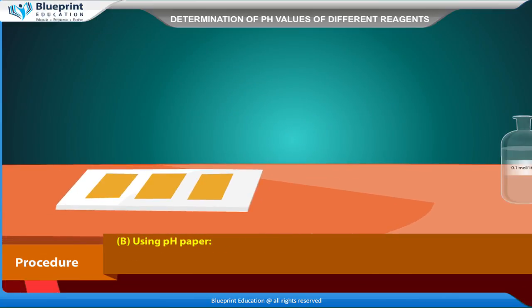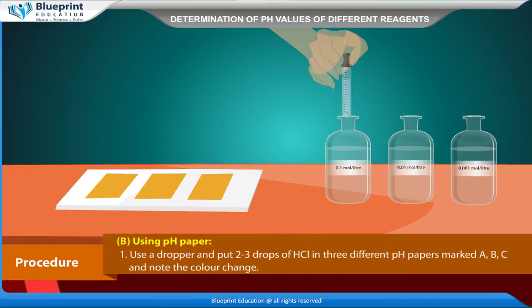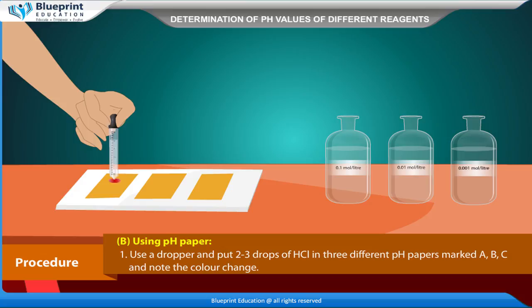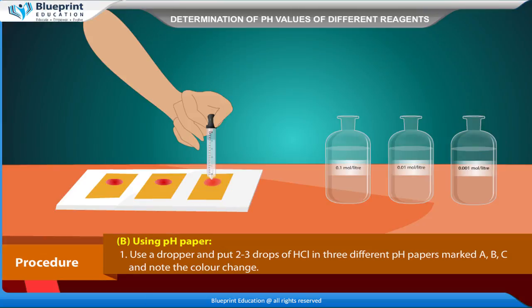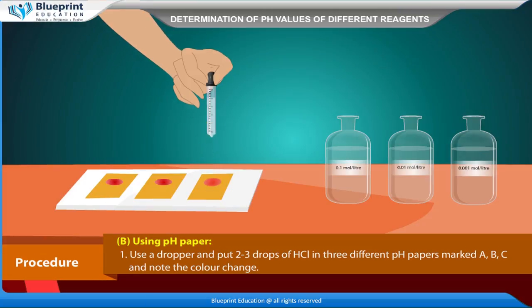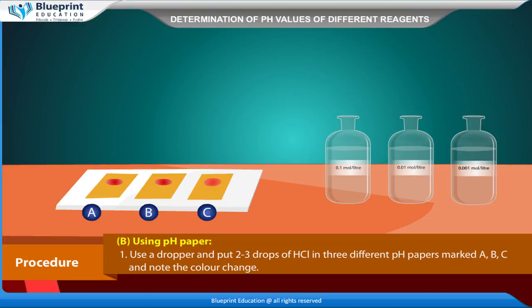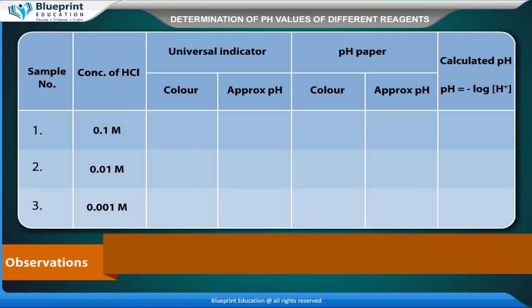Procedure using pH paper: Use a dropper and put 2 to 3 drops of HCl on 3 different pH papers marked A, B, and C. Note the color change in each.